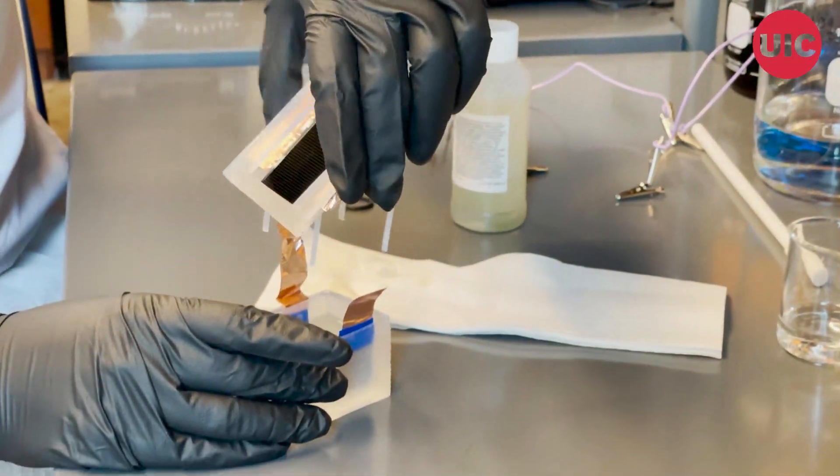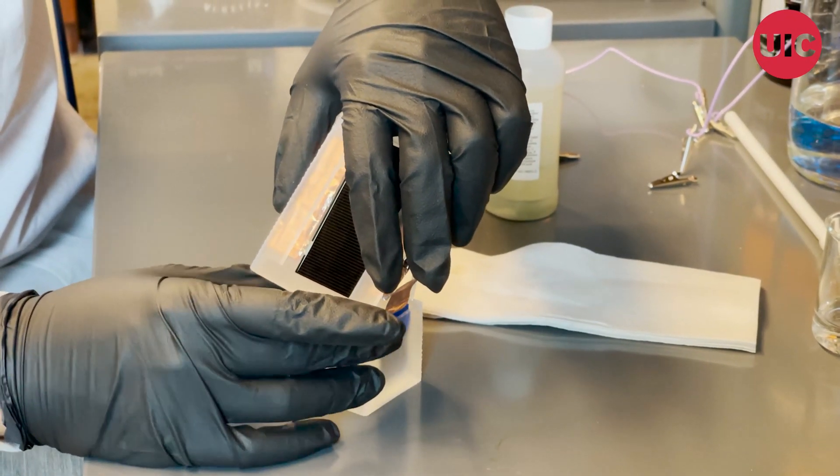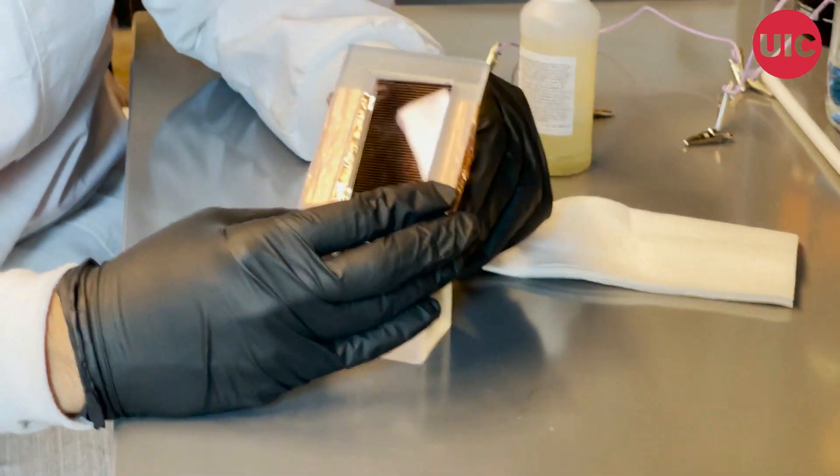Once all of this is done, we will assemble the solar case on top of the electrochemical cell, and that is our complete solar-powered device.